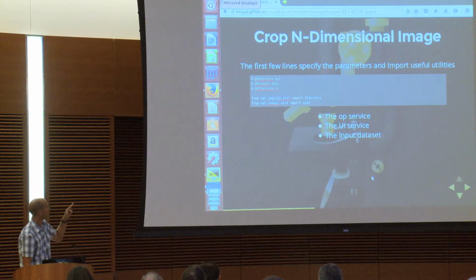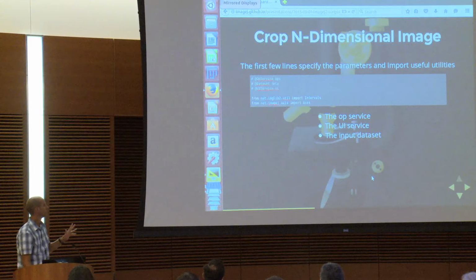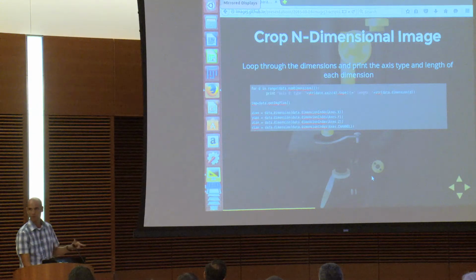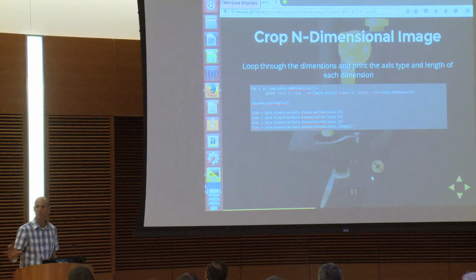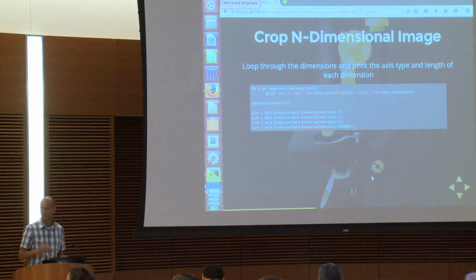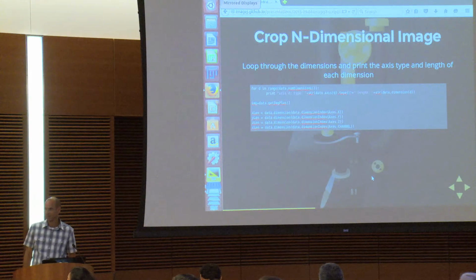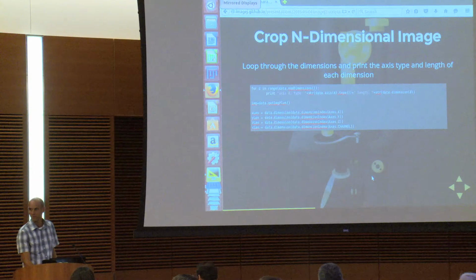My parameter is called data, and from the data, IMG is the image that data contains. This is kind of an implementation detail, actually. When we first wrote this script, we used the data parameter, we didn't use IMG. So the data set is your image, but there's a bug right now. The data set is actually wrapping another object called ImgPlus.